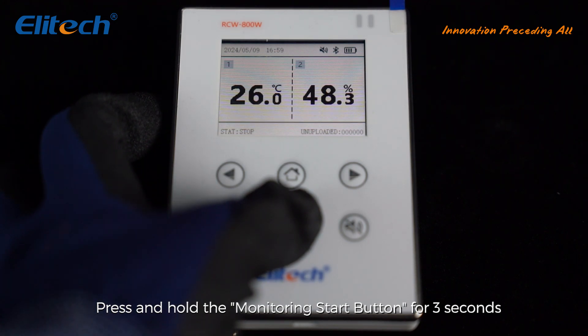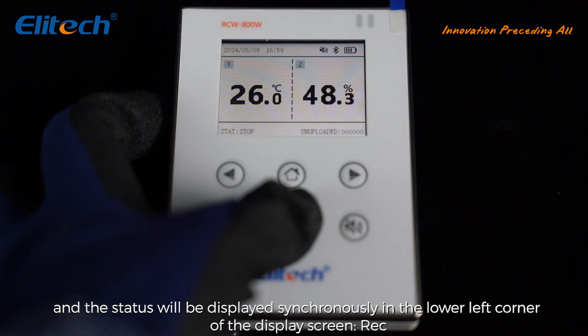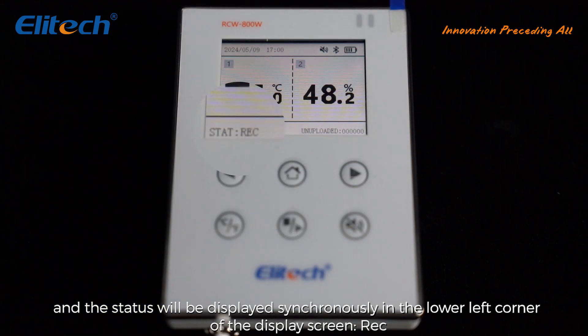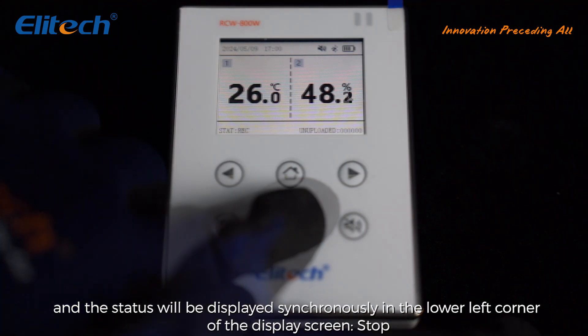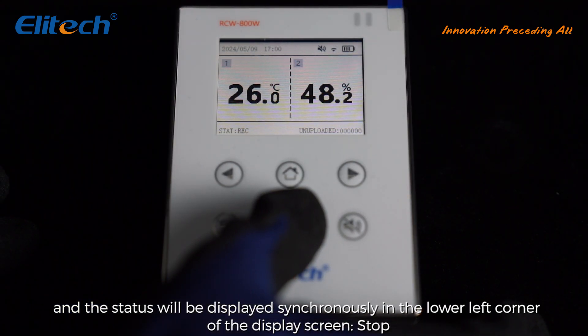Start and stop recording: press and hold the monitoring start button for three seconds; the status will be displayed synchronously in the lower left corner of the display screen. Press and hold the monitoring stop button for three seconds; the status will likewise be displayed synchronously in the lower left corner of the display screen.